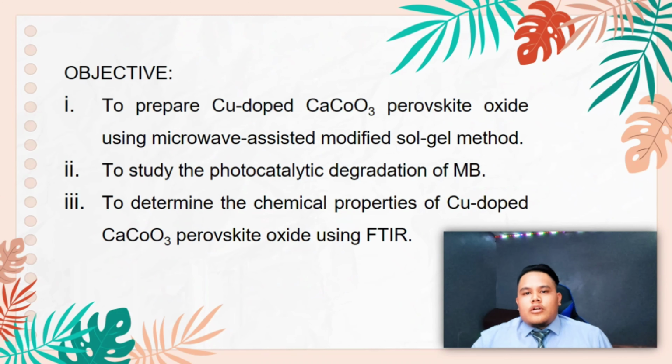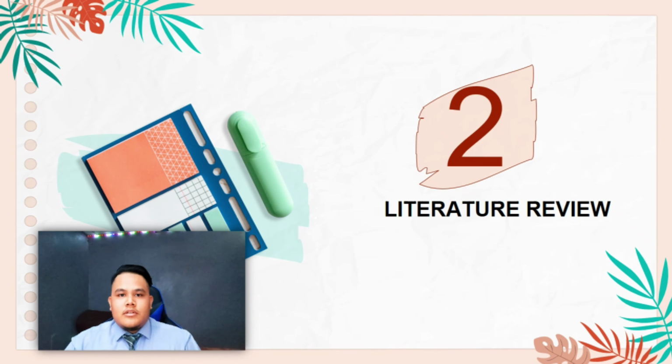According to Wu and Zhu 2016, Sol-Gel method offers greatly decreased diffusion distance and product can be produced at much lower temperature. The objective of this research is to synthesize the Cu-doped CaCoO3 perovskite oxide using microwave assisted modified Sol-Gel method, to study the photocatalytic degradation of methylene blue, and to determine the chemical properties of Cu-doped CaCoO3 perovskite oxide using FTIR. Moving on to chapter 2, which is a literature review.